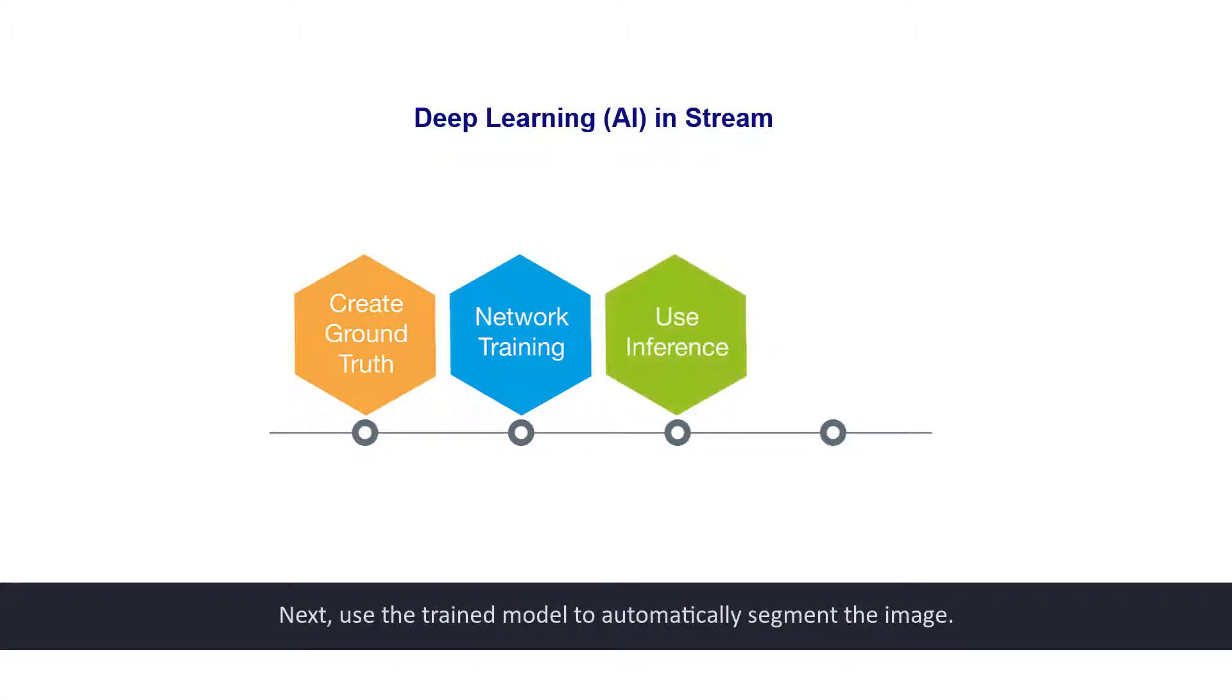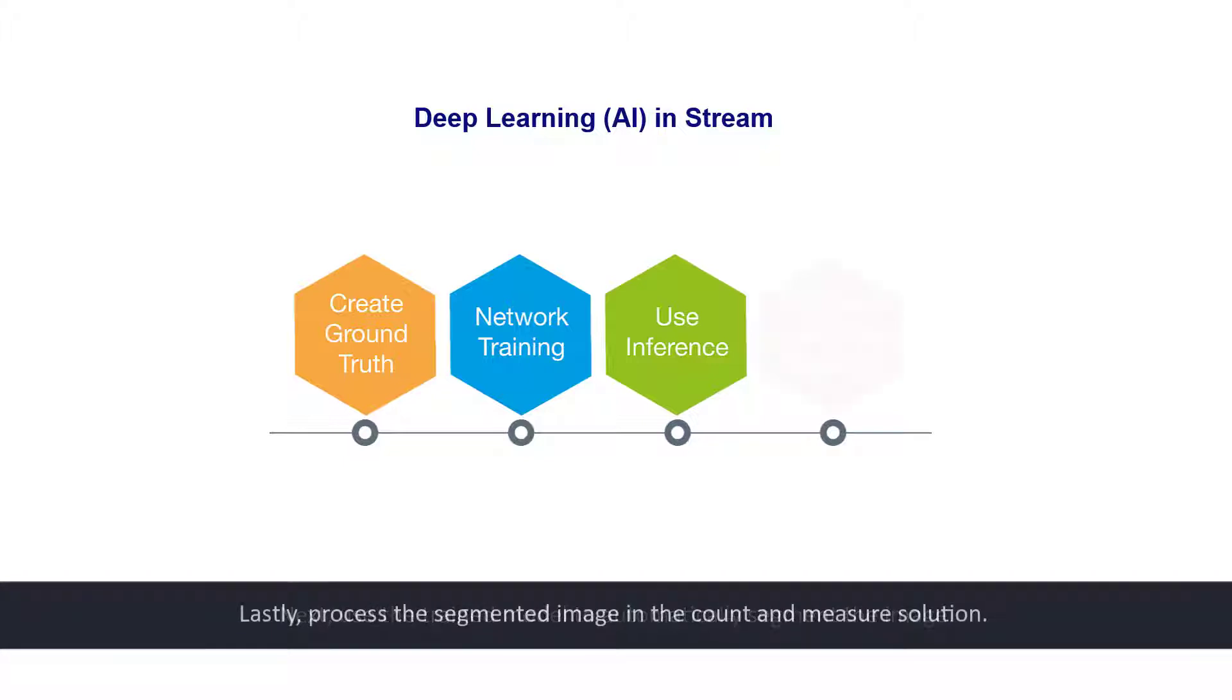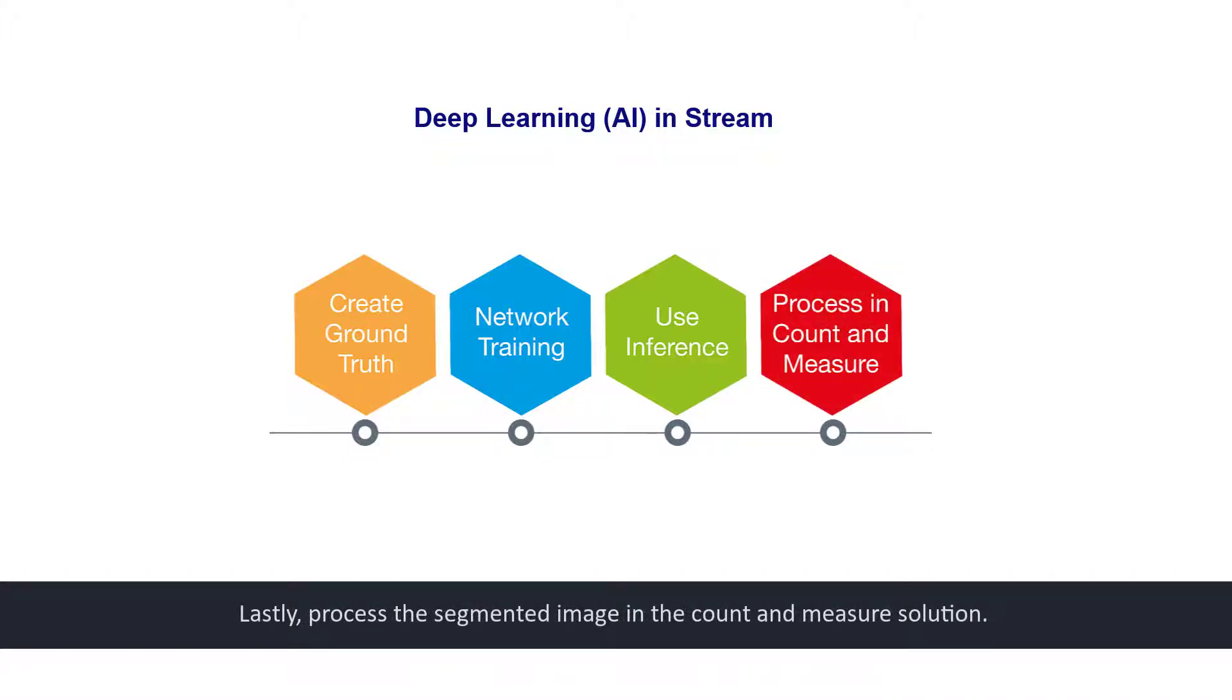Next, use the trained model to automatically segment the image. Lastly, process the segmented image in the count and measure solution.